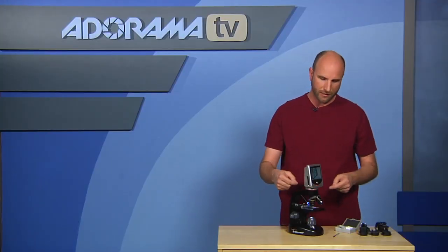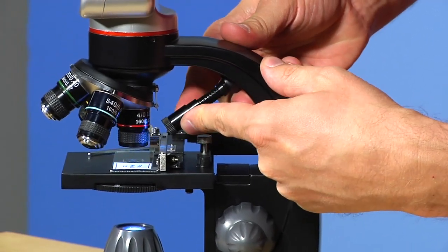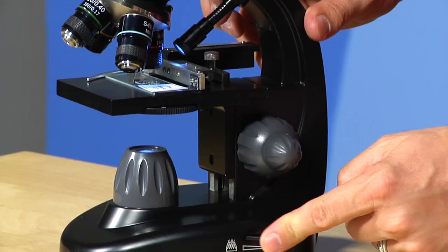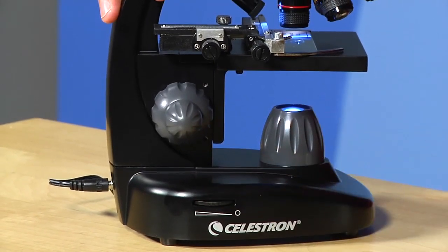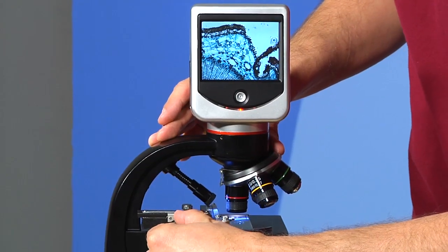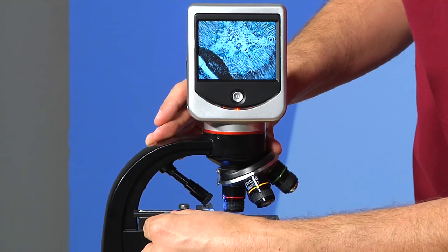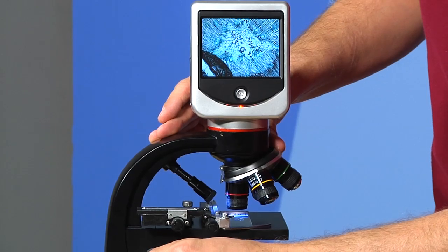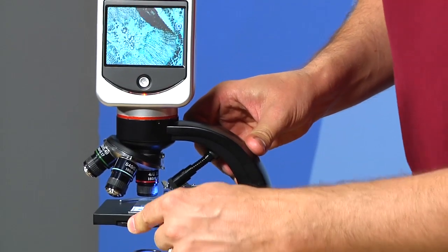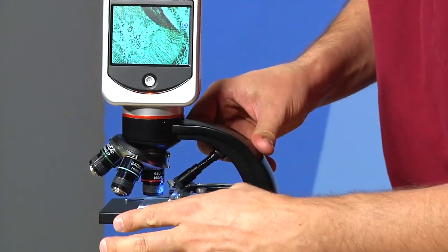The actual slide is illuminated by an adjustable LED light. On the side there's a little light that you can move around — an LED light that illuminates the top of what you're looking at — and then there's a light below that also illuminates the slide. There are two different controls: one on each side that controls the bottom and top lights respectively. There are also two little dials — one moves your slide specimen back and forth and the other moves it left and right, so you can move things in minute detail. On the other side there's a dial that lets you use different diaphragms to change the illumination and increase contrast based on the color of the light coming through.